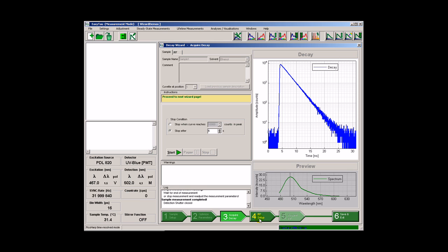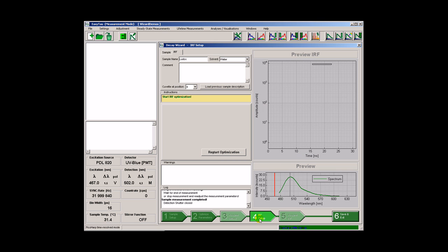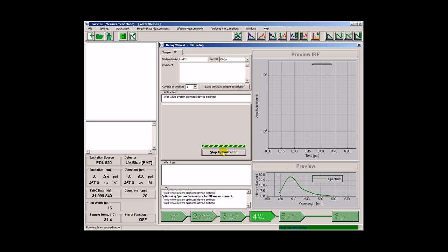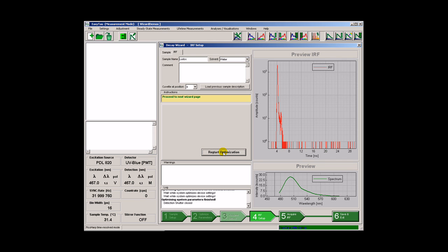The next step is to acquire an instrument response function in order to be able to perform a rigorous decay curve analysis later on. The scattering sample has now been moved into the beam pass. The detection wavelength has been set to that of the excitation source. The wizard has to find an optimal count rate for this new sample. Afterwards, we can record an instrument response function.